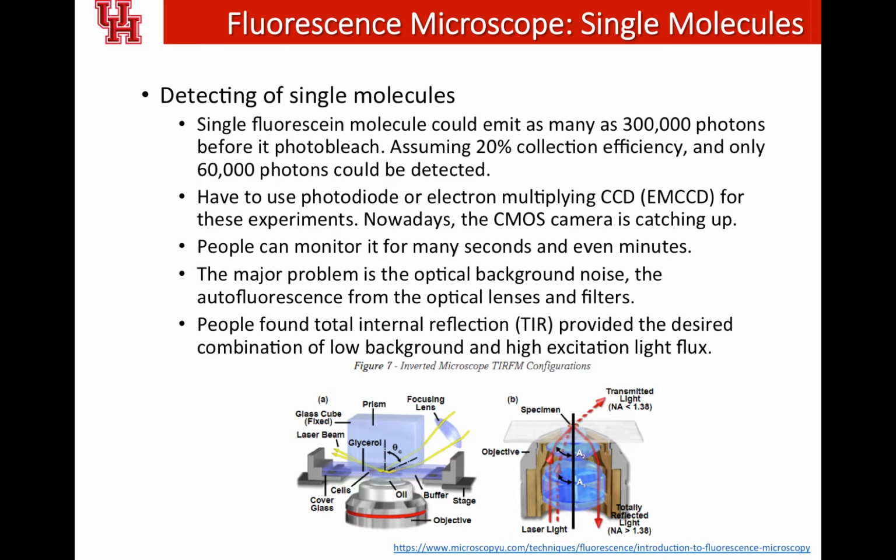Assuming 20% of those photons are collected efficiently and detected, only 60,000 photons could be detected. So obviously you need a really sensitive detector to detect these photons.